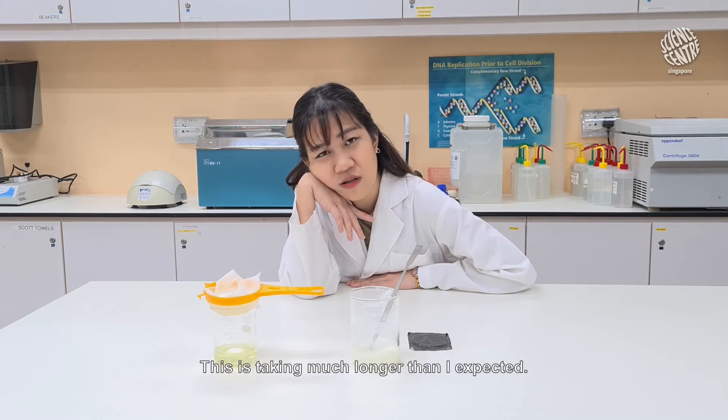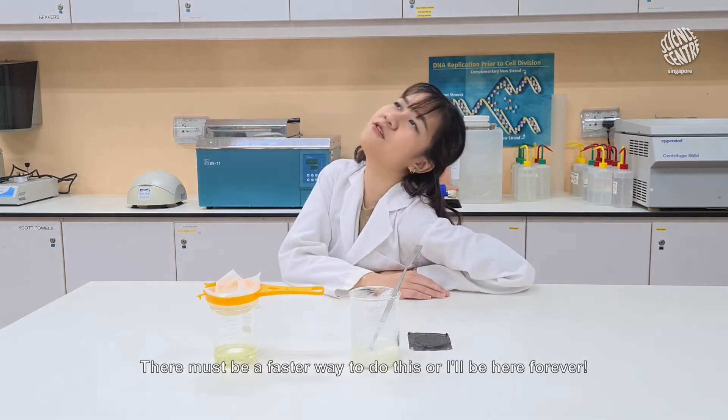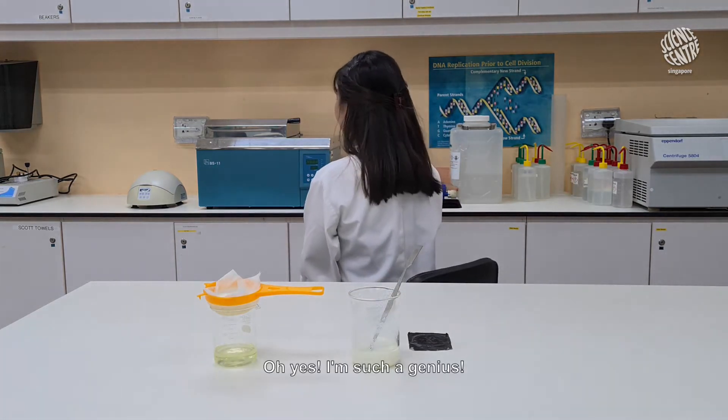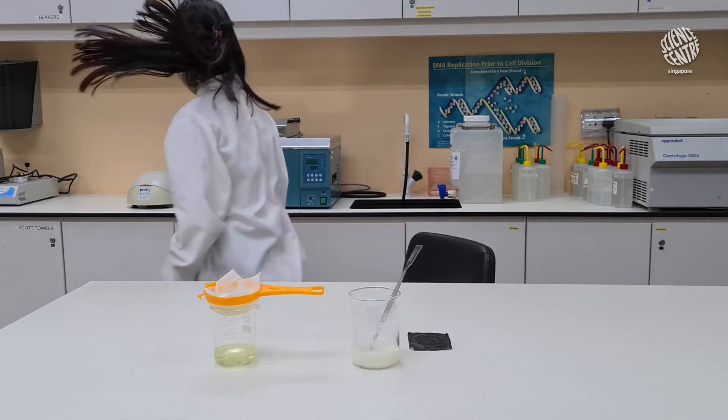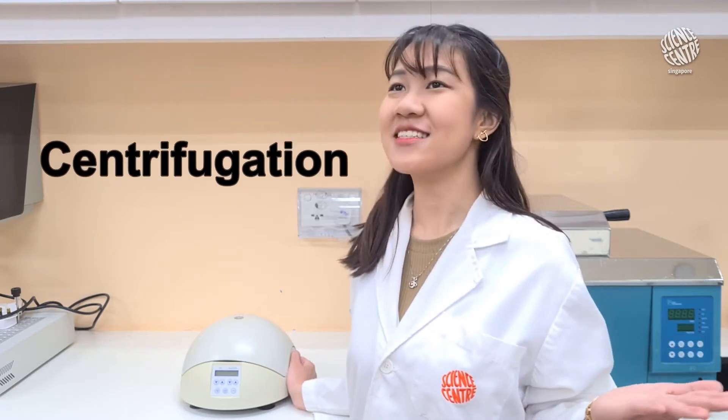This is taking much longer than I expected. There must be a faster way to do this or I'll be here forever. Oh yes! I'm such a genius! I can speed this up using the power of centrifugation.